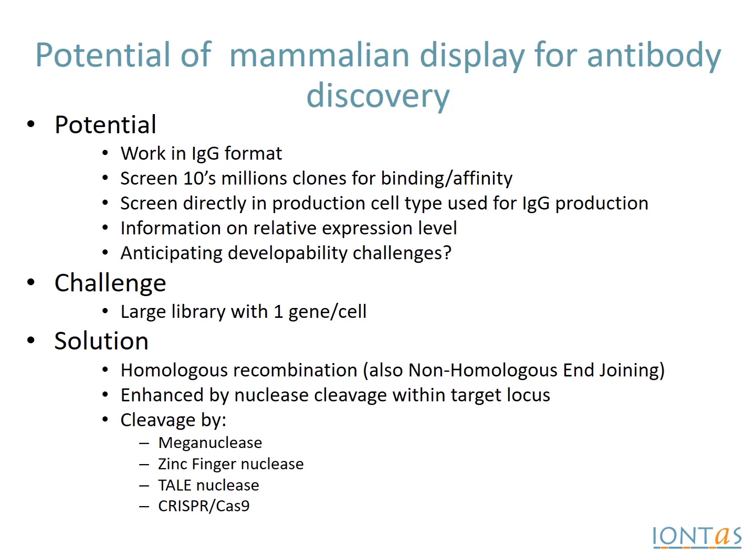This was first described maybe 5 or 6 years ago. Several years ago, of course, CRISPR-Cas9 technology was described, wherein one no longer has to build a specific protein to recognize a DNA sequence, but rather one can do it by generating a small guide RNA. So we have worked with all of those nuclease-directed systems, but most of the work that we've done in the early days was using TAL nucleases, and more recently we've demonstrated the capability of CRISPR-Cas9 as well.